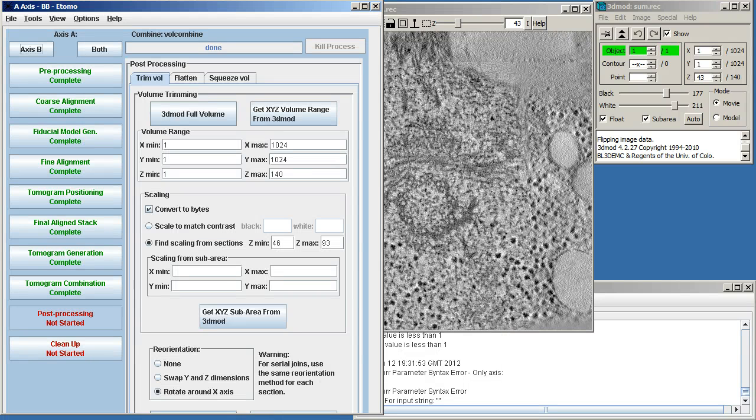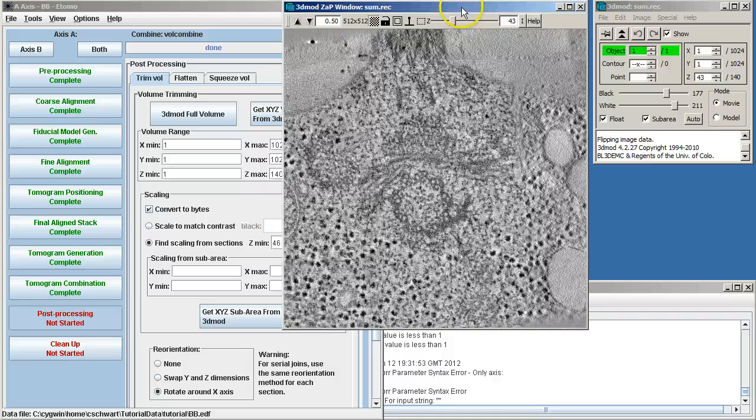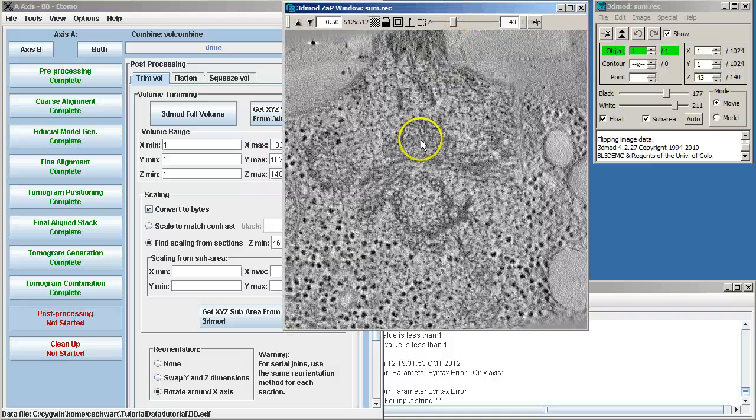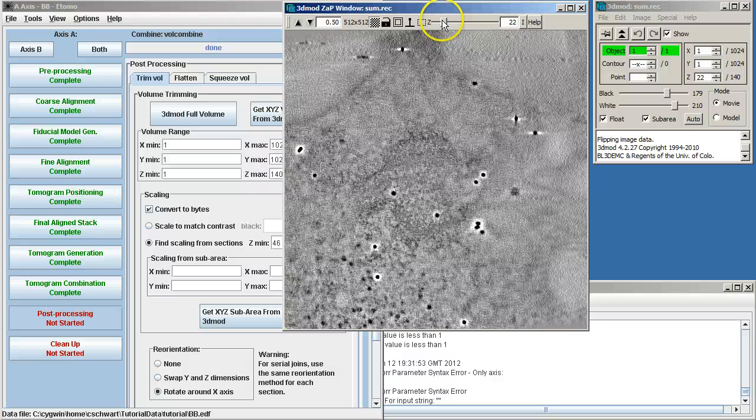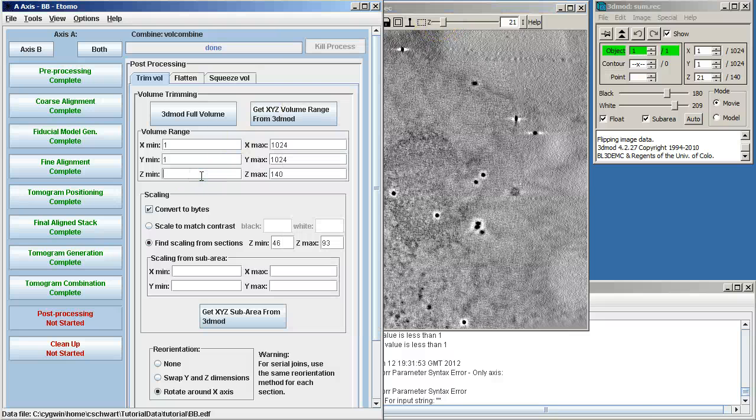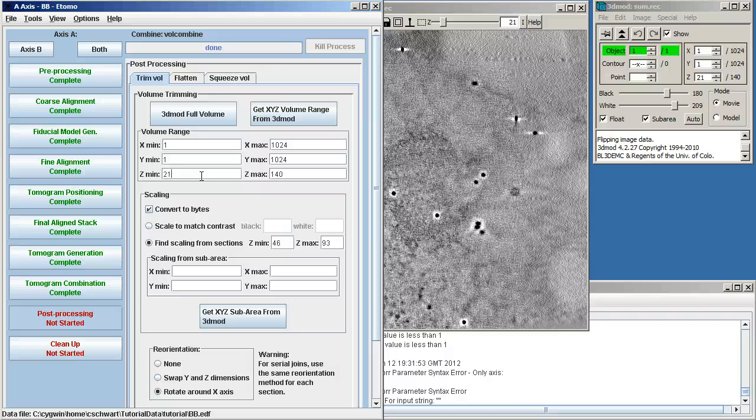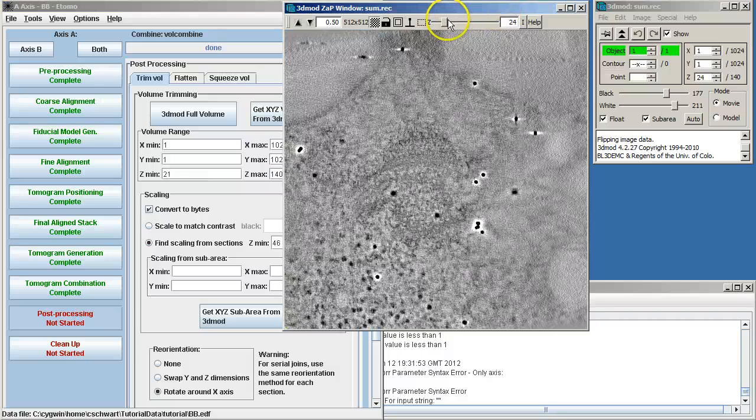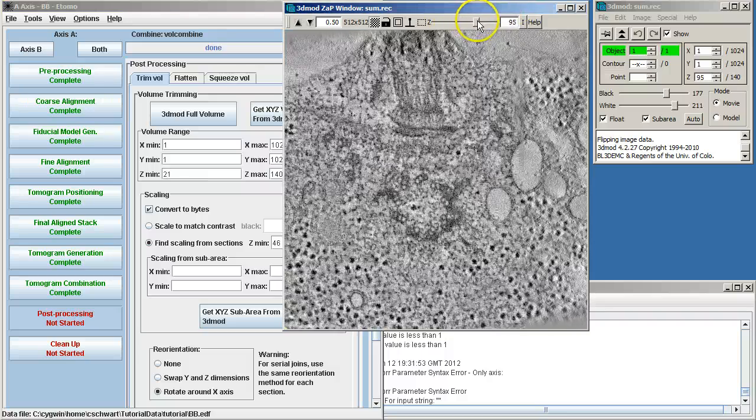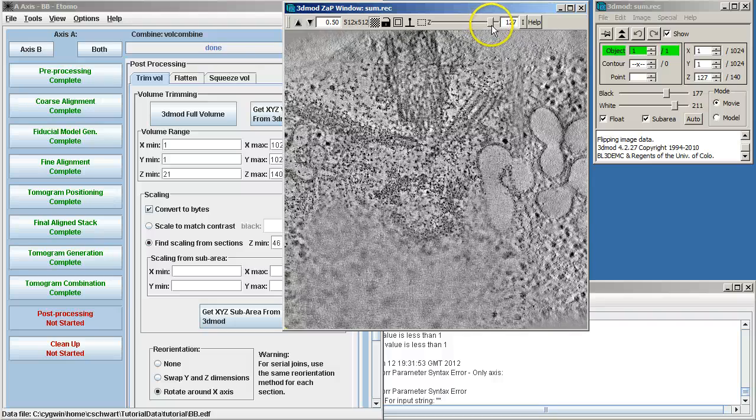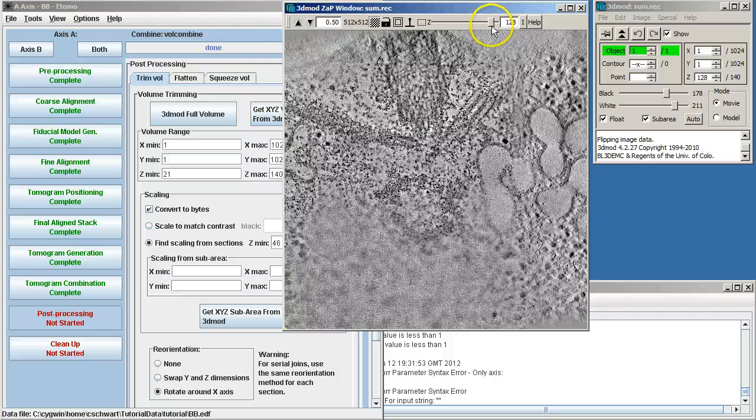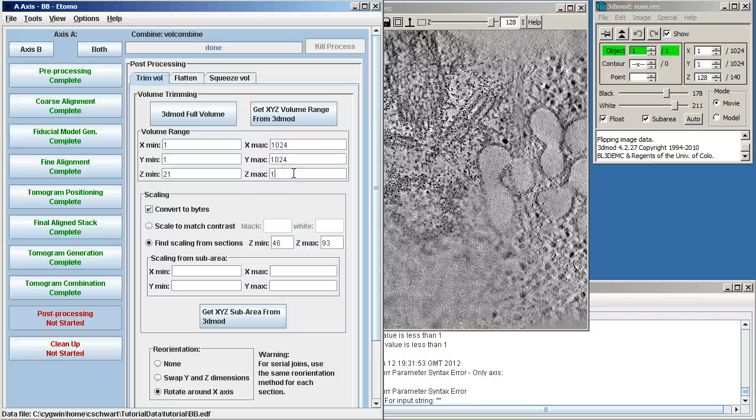And now we need to trim the volume in X, Y, and Z. Here we're going to keep all of the X, Y information, but we're going to trim in Z. So I'll go down until I see the spot where I want to trim off. I'm going to start at Z equals 21 and then to the top surface, ending with Z equals 128.